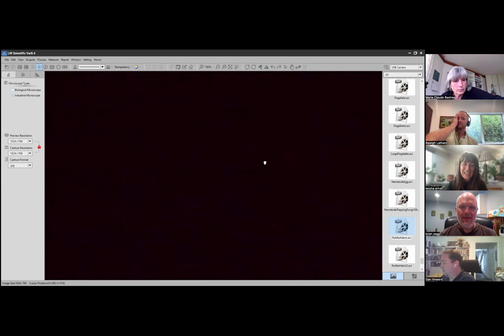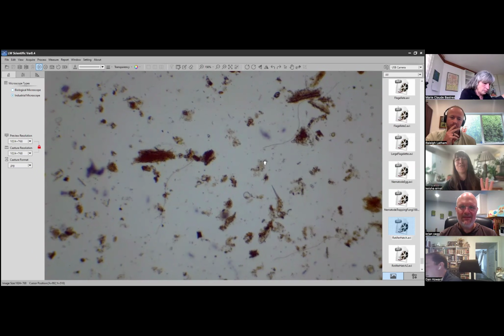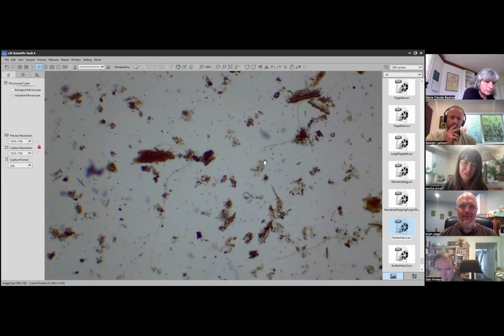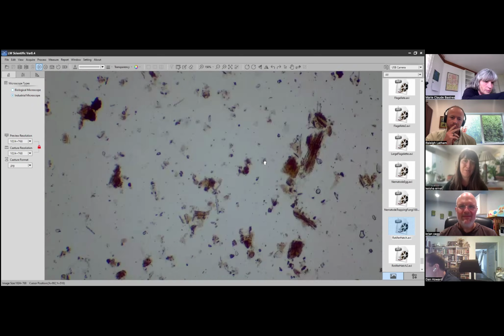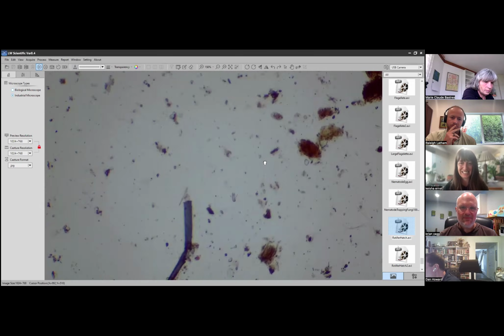But for me, I like looking at 100 times what the eyes can see, 400 at most, just because the clarity is still so beautiful. You need to get into really expensive microscopes and processes if you want to see the teeniest of the lives.